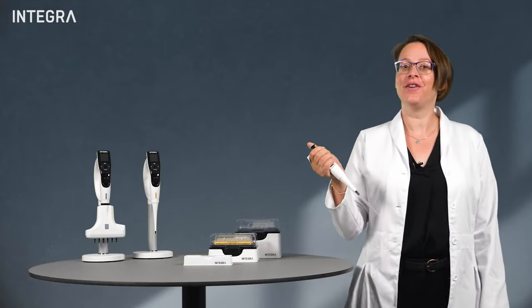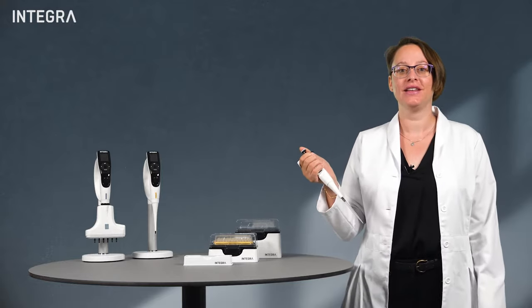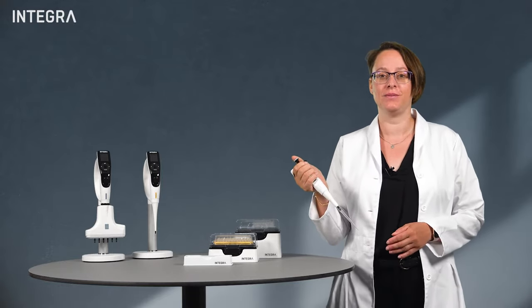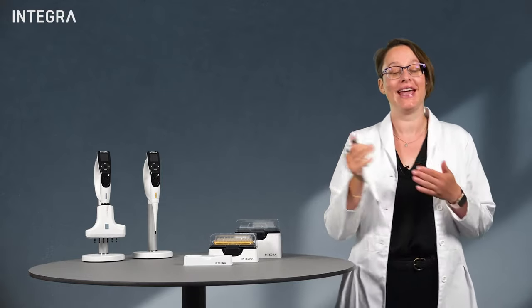Hello everyone! Before we get started, it's important that you understand the difference between the terms accuracy and precision.